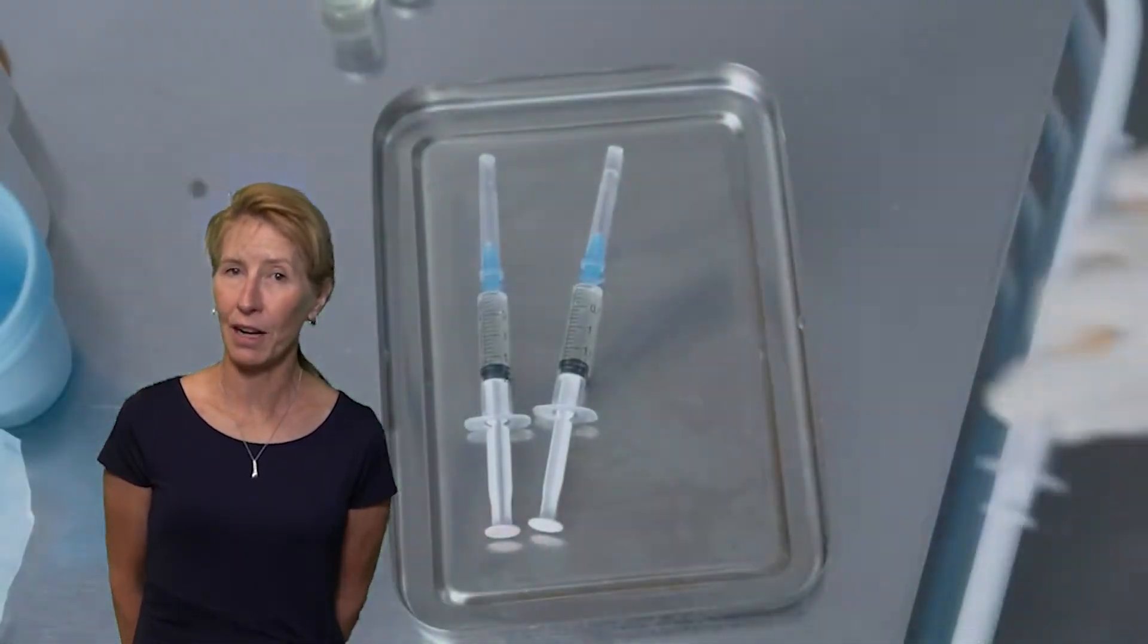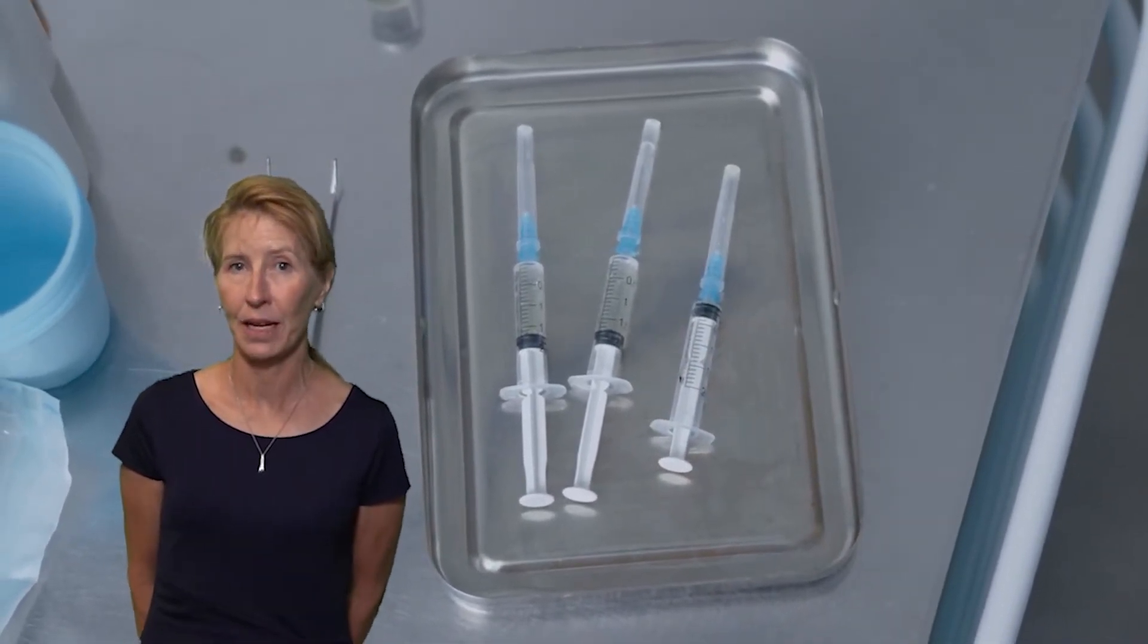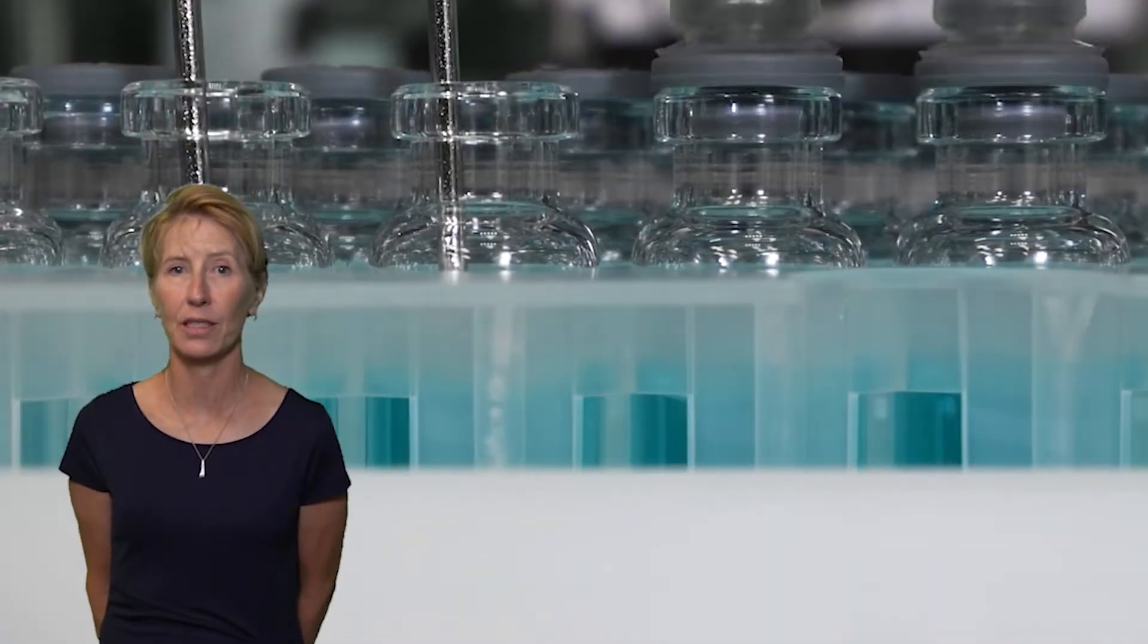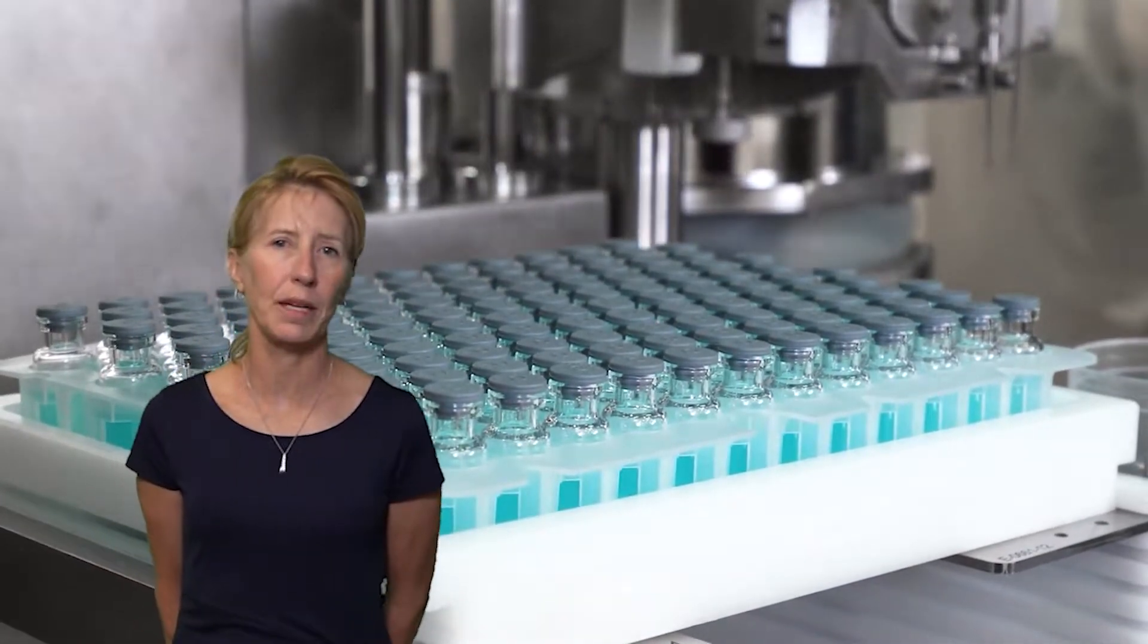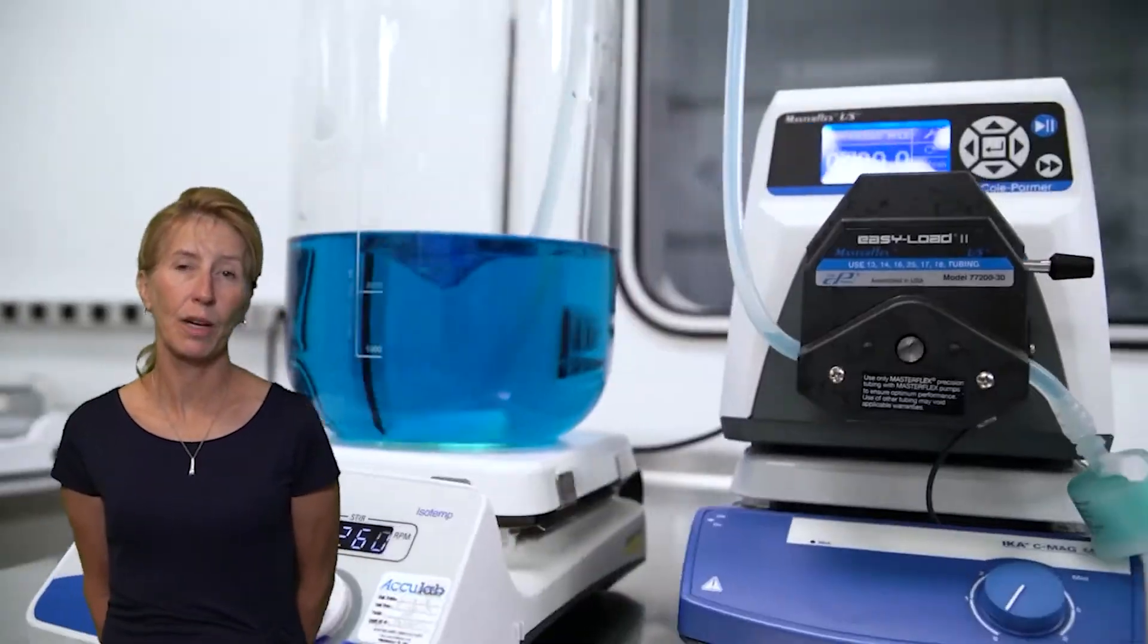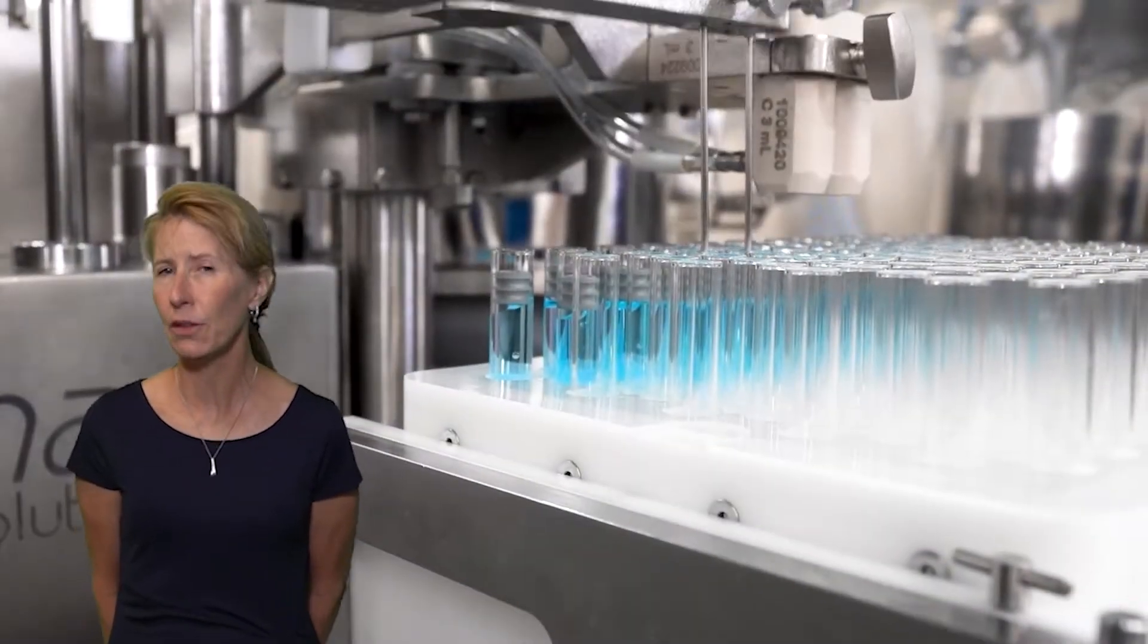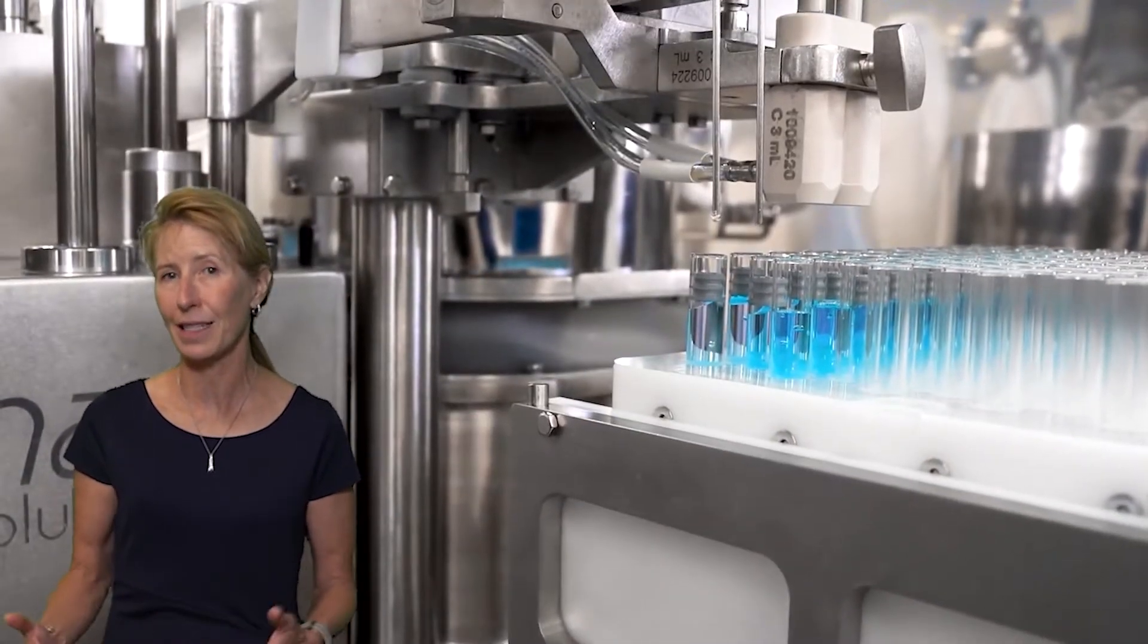So you can be confident that that injection you are receiving will make you healthier and not sicker. That is our job at Berkshire Sterile Manufacturing. We work with many pharmaceutical companies that have injectable medicine to manufacture their products so it is sterile and safe to inject. The pharma company will give us directions for making the drug, kind of like a recipe. We gather the ingredients, create a large volume of solution, sterile filter it, and fill it into either a vial, syringe, or cartridge in an aseptic environment, which we term isolators.